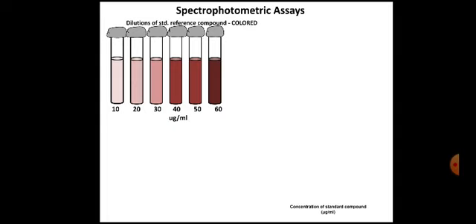Now let us see if the fermentation product whose quantity you want to measure is a colored compound, for example riboflavin. It is a vitamin, and riboflavin has an orange yellow color. So if the fermentation product is self colored, then what can be done?